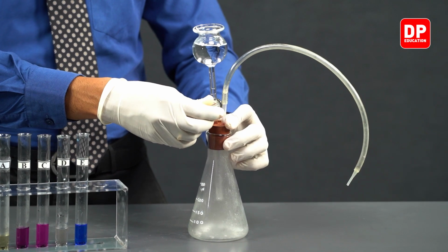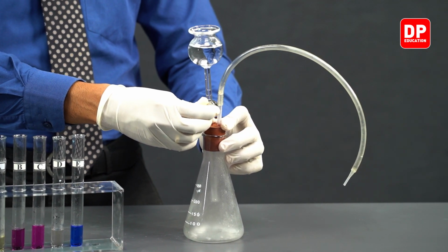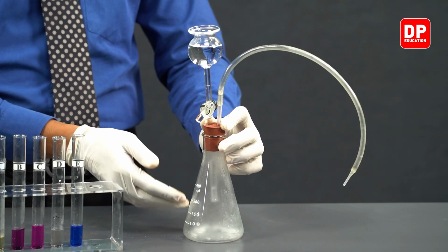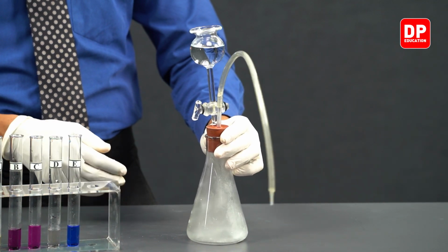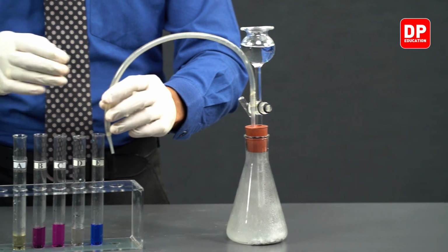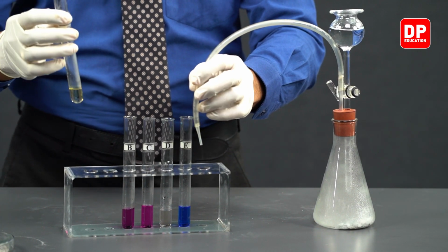We will regulate the amount of water that is added, so that water is added drop by drop onto our calcium carbide, and we can move on to inserting this delivery tube into each of these reagents that we have here and observe the color change.